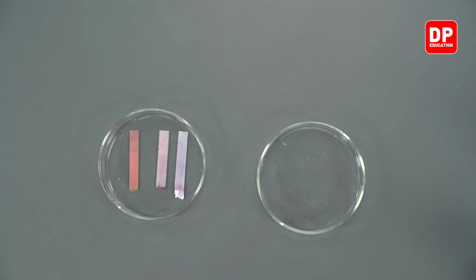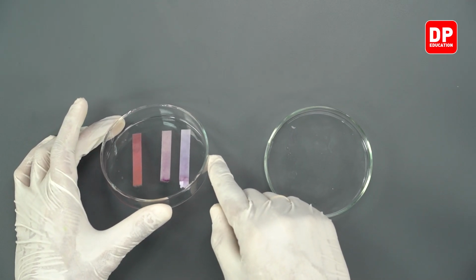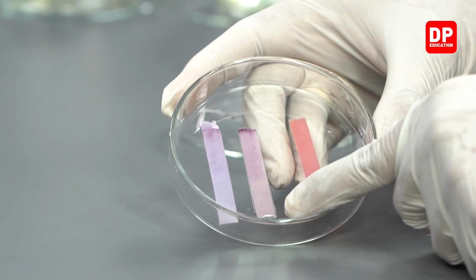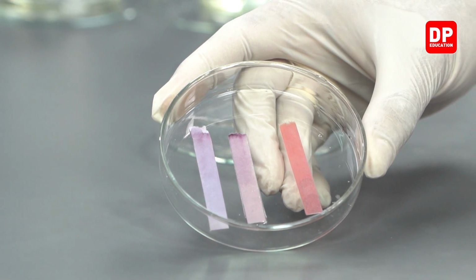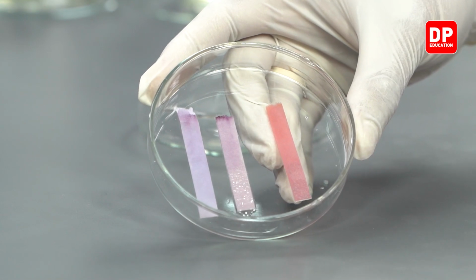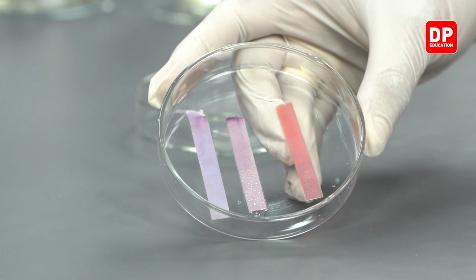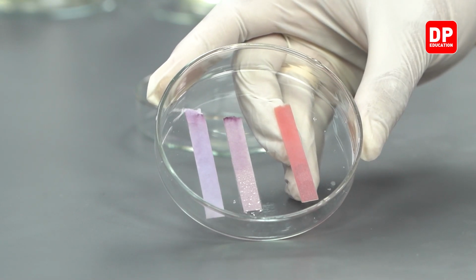distilled water. You can see normally when the blue litmus paper is made wet, it is going to remain blue, but you can see the blue litmus paper added with the phenol solution has turned red. So very clearly we can see now the color change that has taken place in our blue litmus paper, because we can compare it against the control where we added a little bit of water to a piece of blue litmus paper.